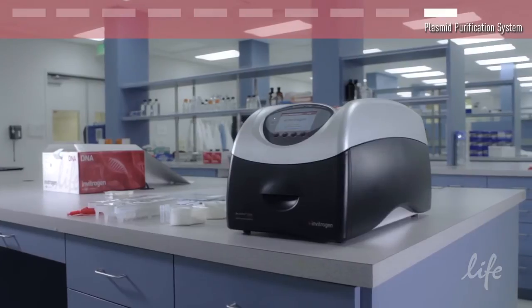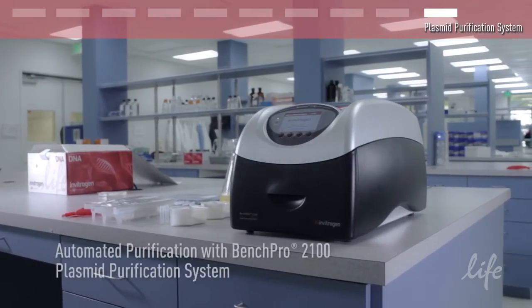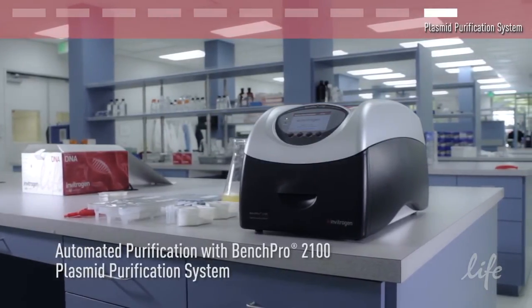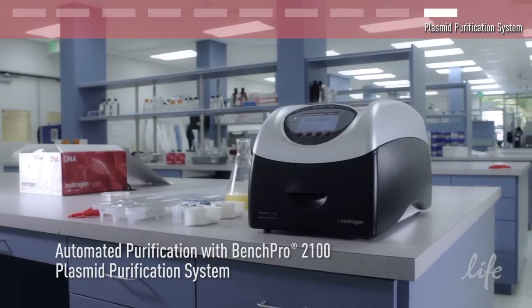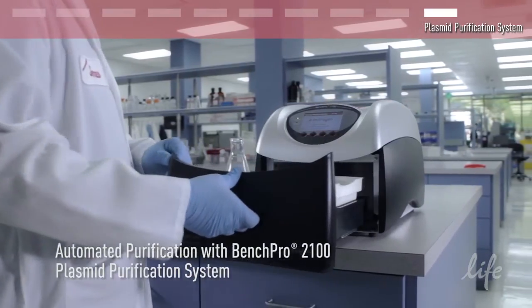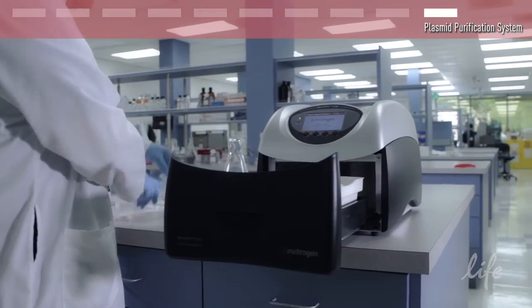Another option for large scale plasmid purification would be our automated hands-free solution, the BenchPro 2100 Plasmid Purification System. This system has three simple steps which takes less than five minutes to complete.